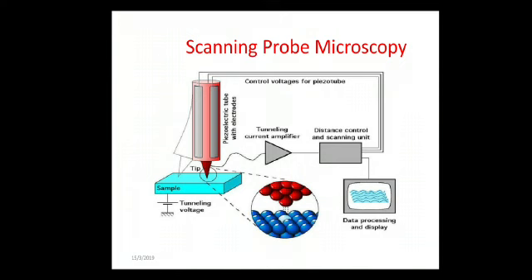When the tip is near the sample surface, the cantilever is deflected by a force. Scanning probe microscopes can measure deflections caused by many kinds of forces, including mechanical contact, electrostatic forces, magnetic forces, chemical bonding, van der Waals forces, and capillary forces. The distance of deflection is measured by a laser that is reflected off the top of the cantilever and into an array of photodiodes that is similar to the devices used in digital cameras.